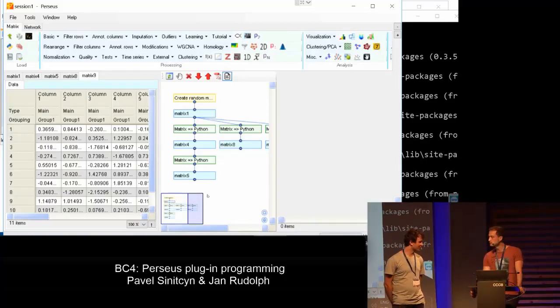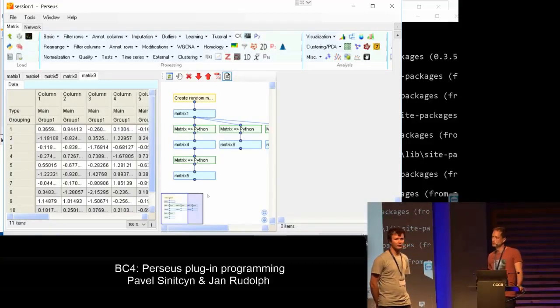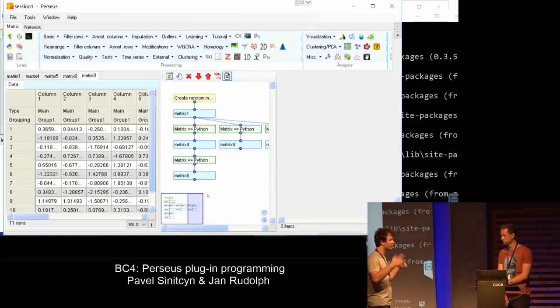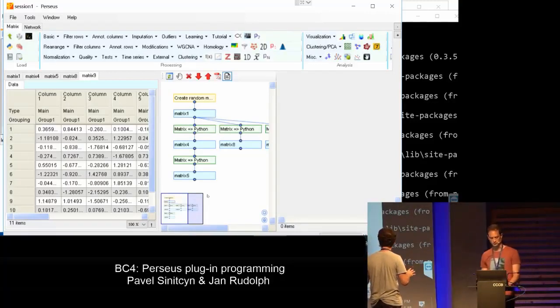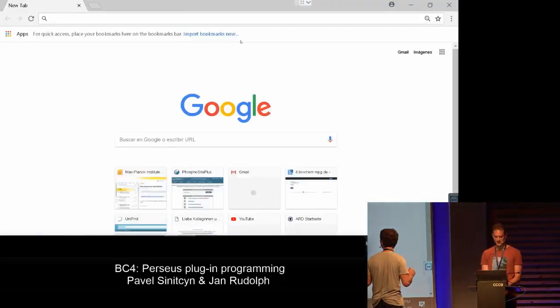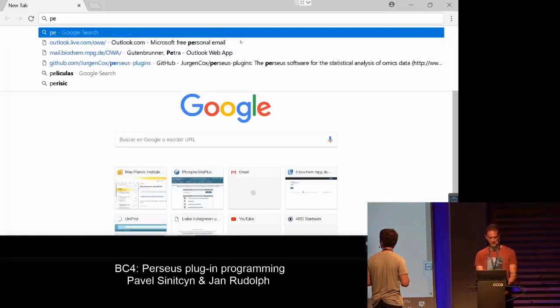Basically you can also just save it as a Perseus session and give this session to people and ask them to open it, and it's going to be fine. So it's also a solution. Let's say one more thing about R. Can you just show the interface with R? Is it basically the same or not? Yeah, it's super similar. I already talked about Perseus Pi.